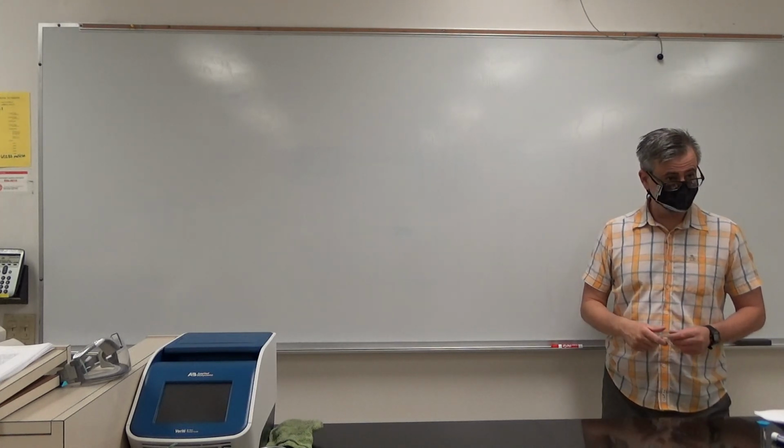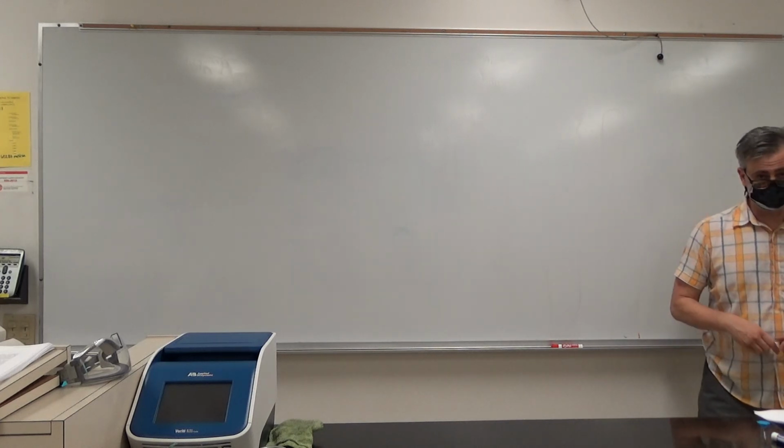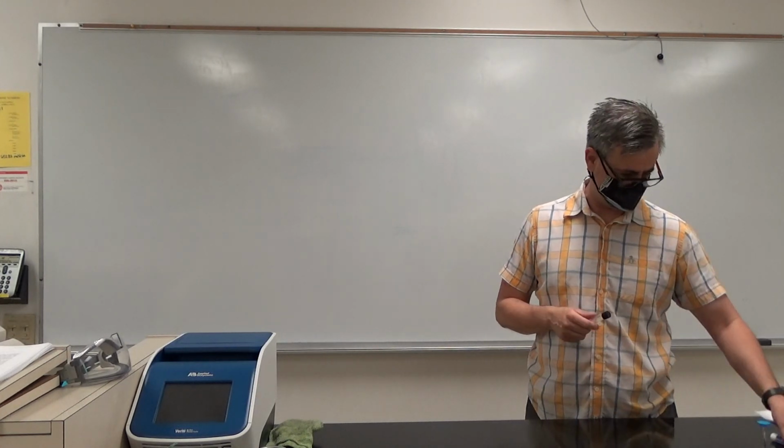Okay, so we're going to do an extraction, okay? It's where you take something out of something. Probably many of us did an extraction this morning.